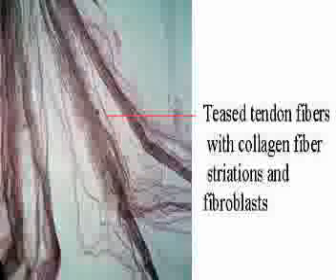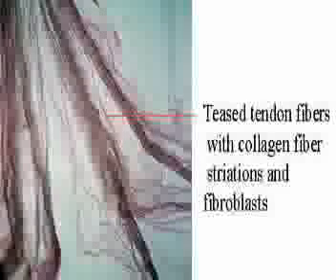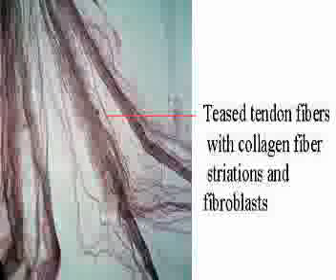Tendons. Tendons have highly packed collagen fibers, which have more fibers than cells. The cells are fibrocytes that assist in the formation of collagen fibers. They have faint longitudinal repetitive striations.